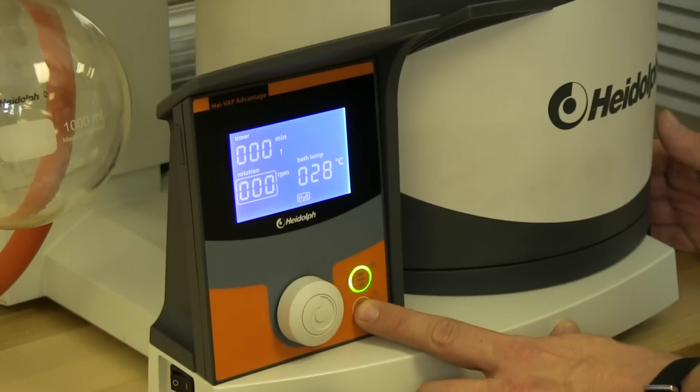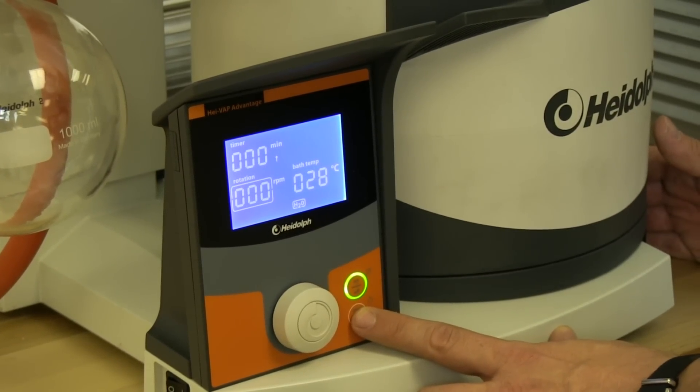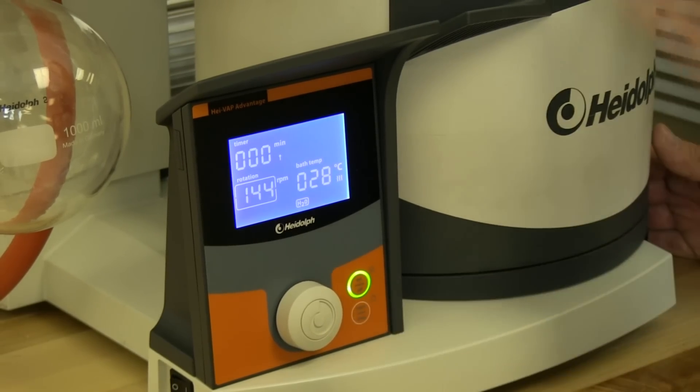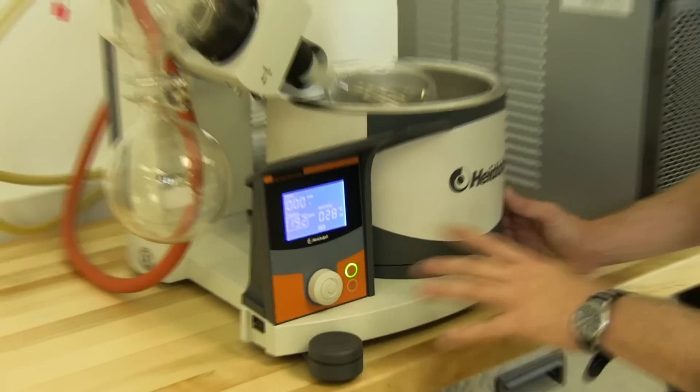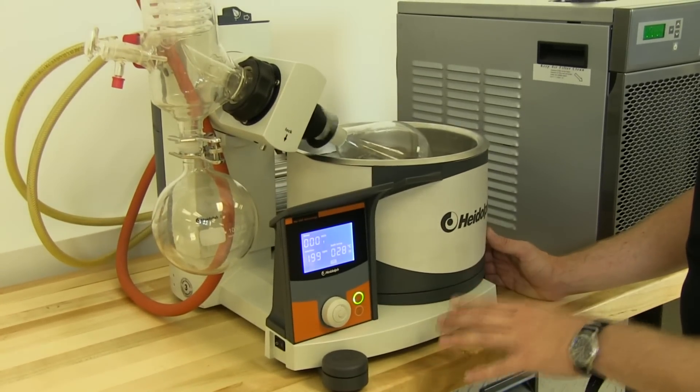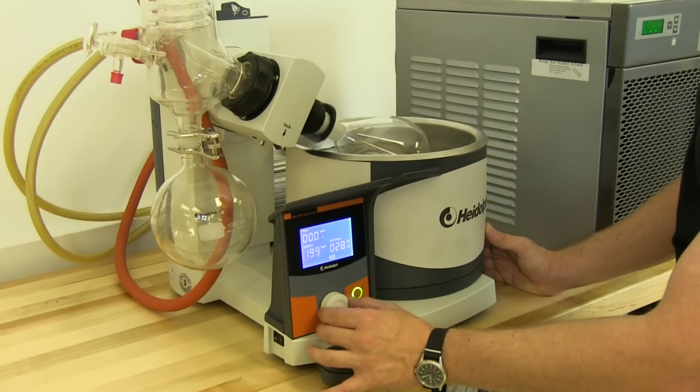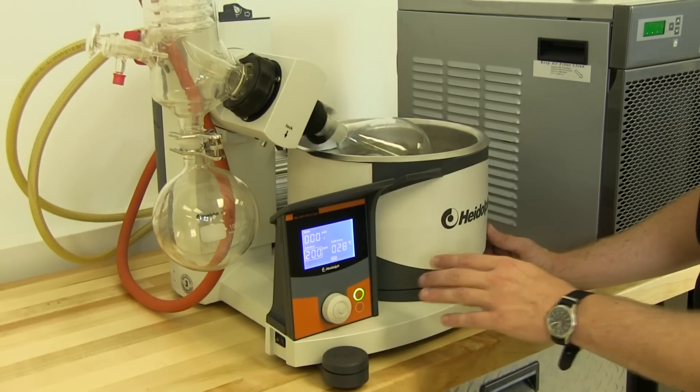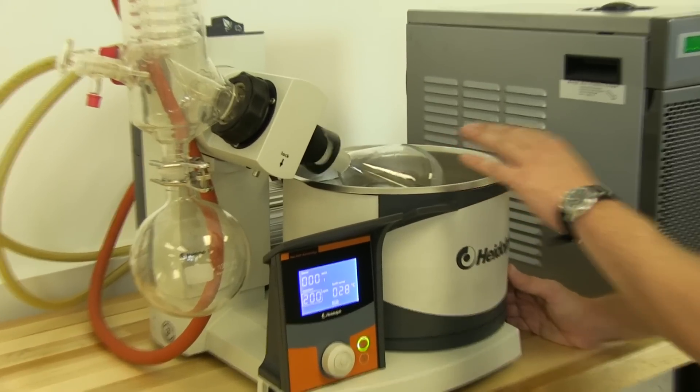We have a start-stop button for controlling the rotation. Now, this is a completely empty system right now. We are not pulling vacuum on it or anything, but we have it set to 200 RPMs. You can go faster if you want. You can go slower depending on what you have and the viscosity.